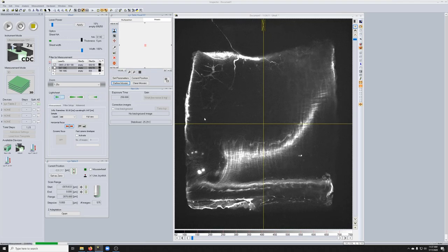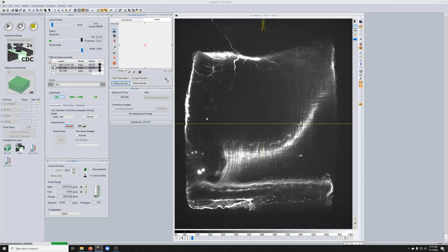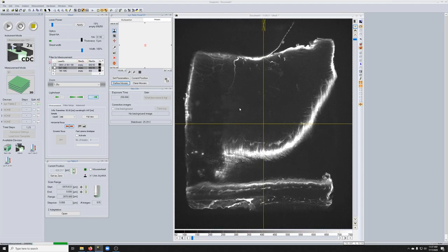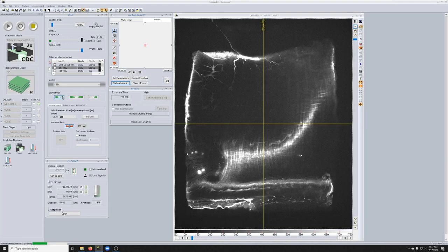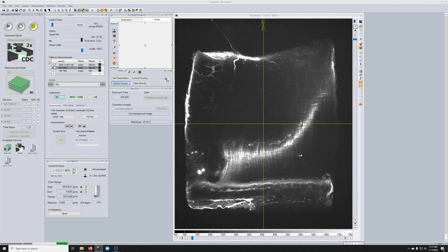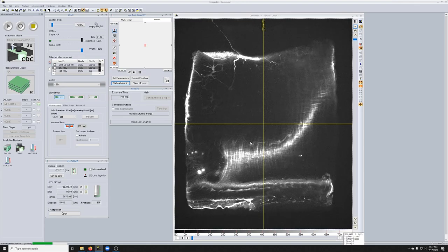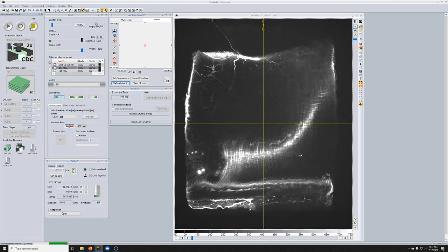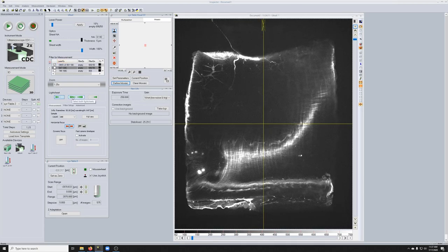So when you image with both light sheets, what the system does is it takes an image with the right light sheet, so an image like this, then it takes an image with the left light sheet, and it takes the two images separately, but then merges them together with a small interpolation region here. So this looks like the following.